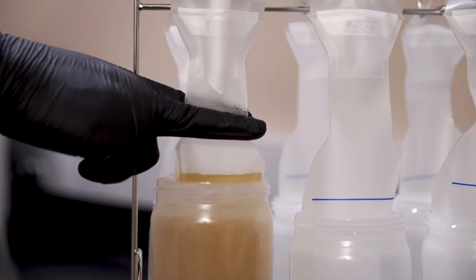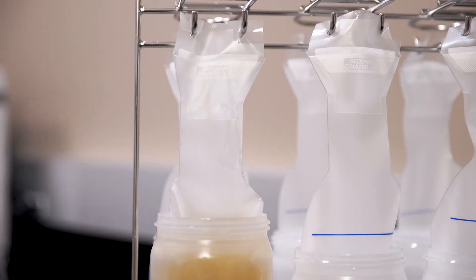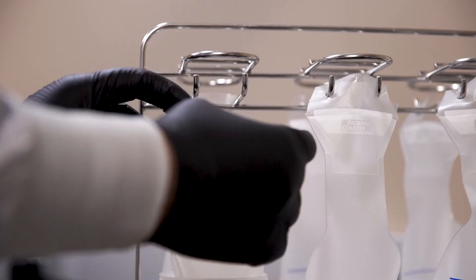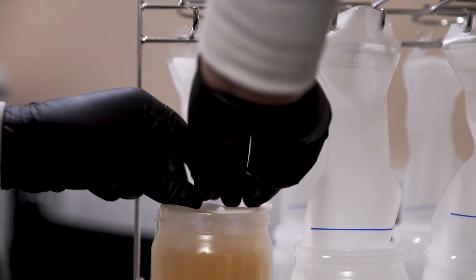Remove residual air by sliding your fingers up the liner, removing the funnel as your fingers reach and seal the valve. Lift the bottle and unhook the sealed liner. Then fold the liner into the neck of the bottle, making sure not to pinch the liner when closing.